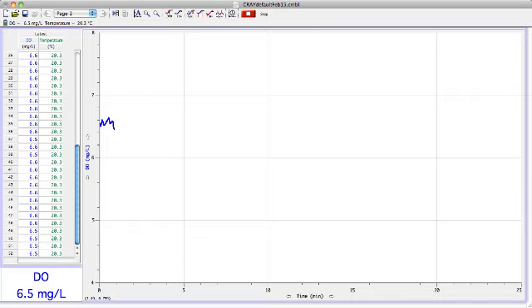So what we should see is a steady oxygen level at about the level where you'd expect the water to be saturated with oxygen. We want to make sure that this line right here is relatively stable. Shouldn't be going up or down, it should be stable because that's going to be our baseline.